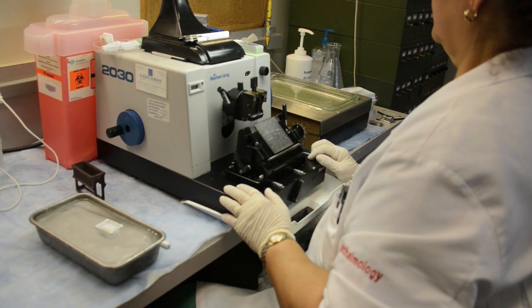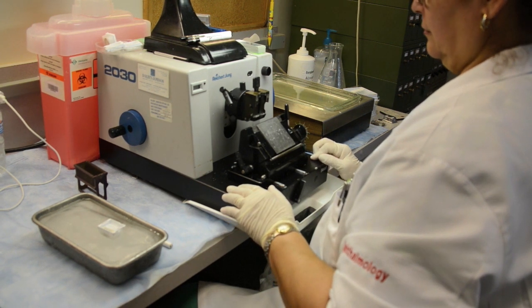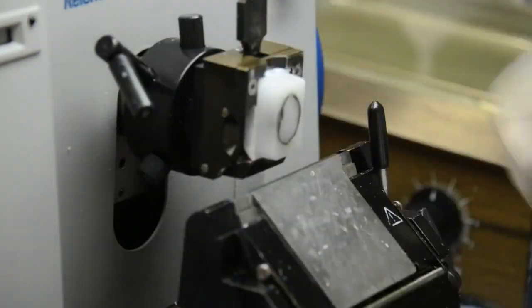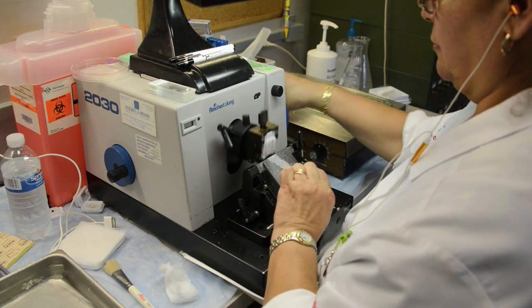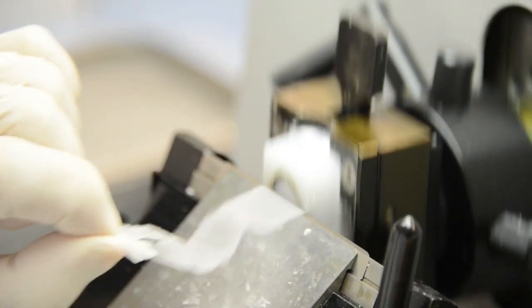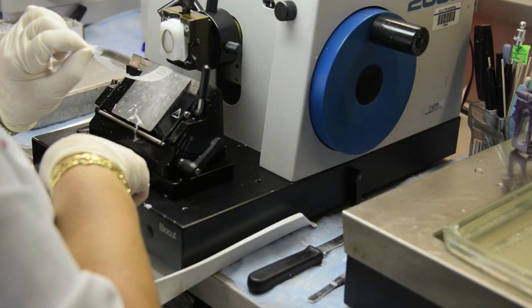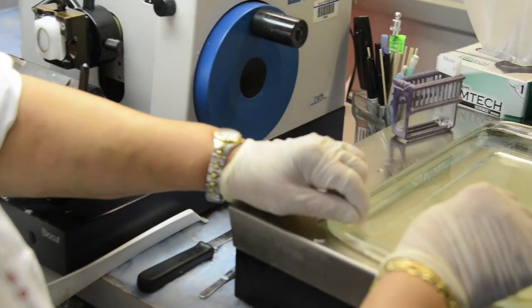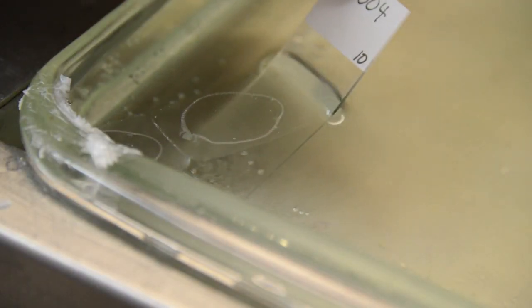The specimens are cut using a specialized instrument called a microtome. The paraffin block containing the tissue is placed in the chuck of the microtome. A ribbon of sections measuring 5 to 7 microns in thickness is cut. The ribbon of sections is transferred to the surface of a heated water bath, which makes the wax expand. The sections are separated and picked up with glass slides.